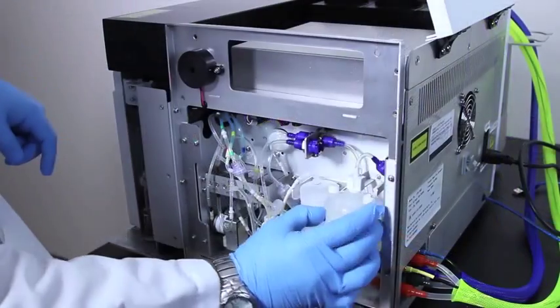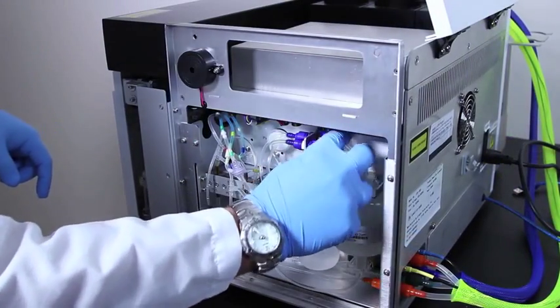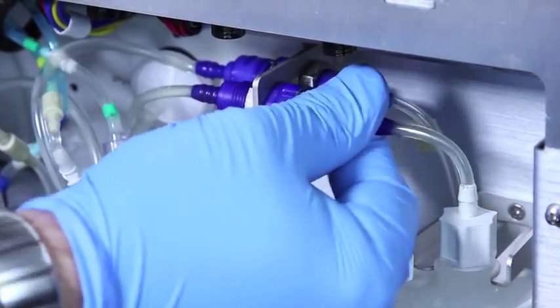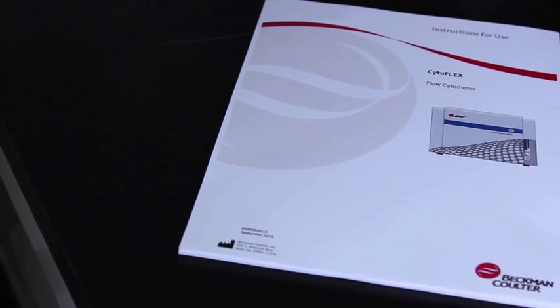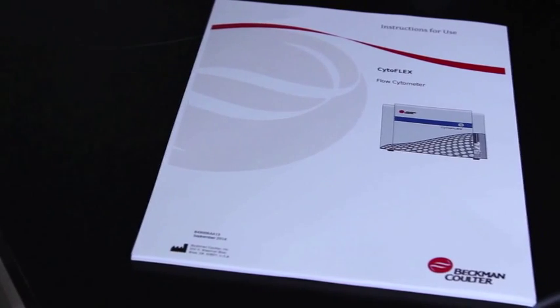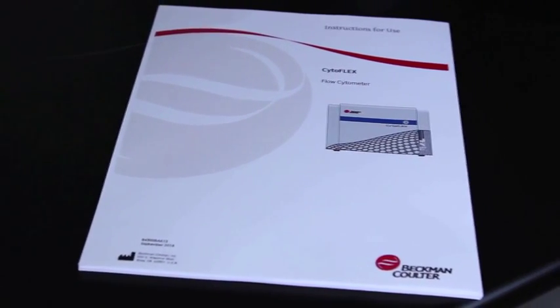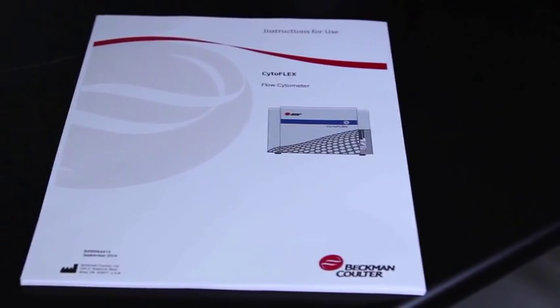Replace the new sheath filter by reconnecting the quick connectors located at both the top and bottom of the sheath filter area. Please refer to your IFU for detailed instructions on how to bleed the air out of the new sheath filter. This ends the sheath filter replacement procedure.